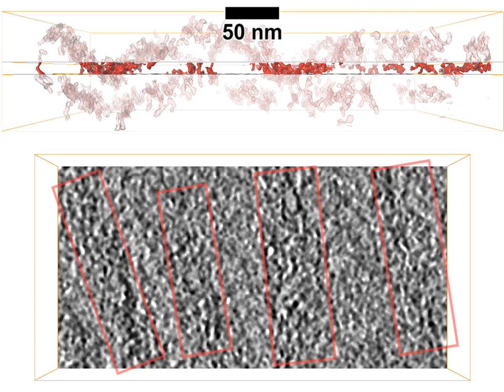In this particular slice, the strips of sacculus are boxed in red, and the intervening low-density buffer is boxed in yellow.